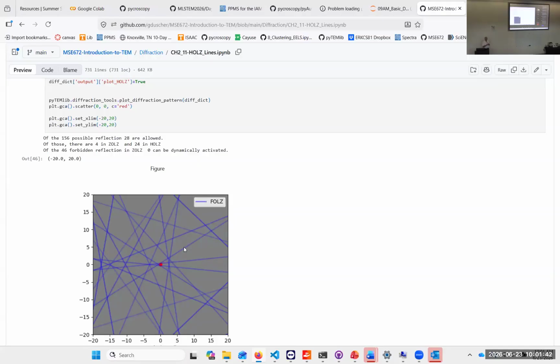So it's very, very precise. So you can determine the size of the unit cell within a picometer, and so you can map the strain field of strain-enhanced silicon devices. So you can do this kind of stuff by just looking at it.